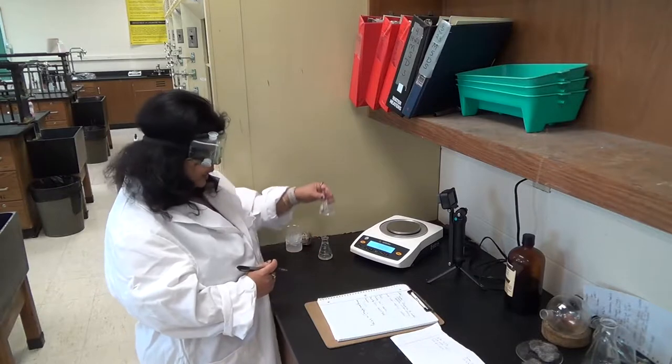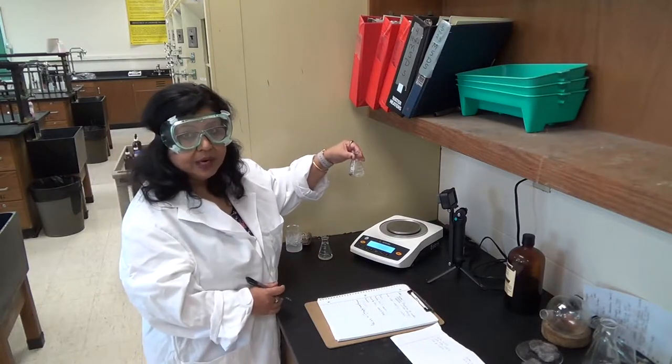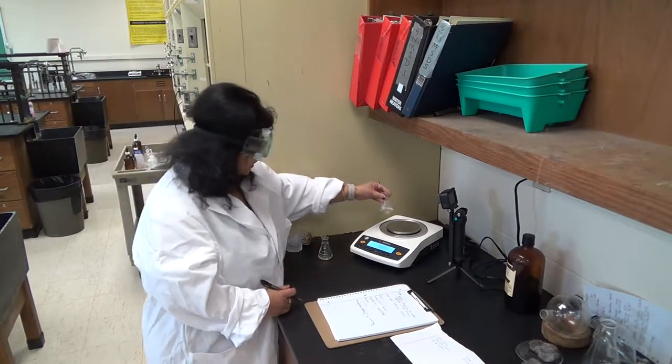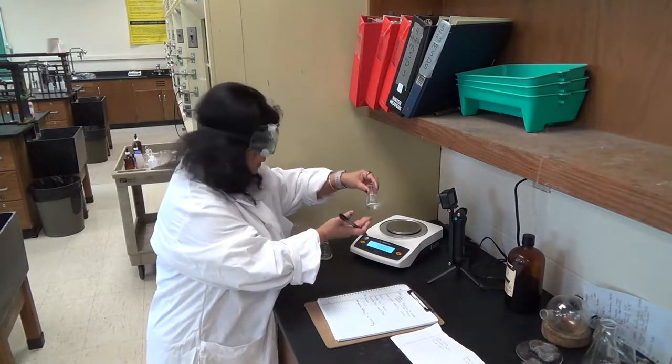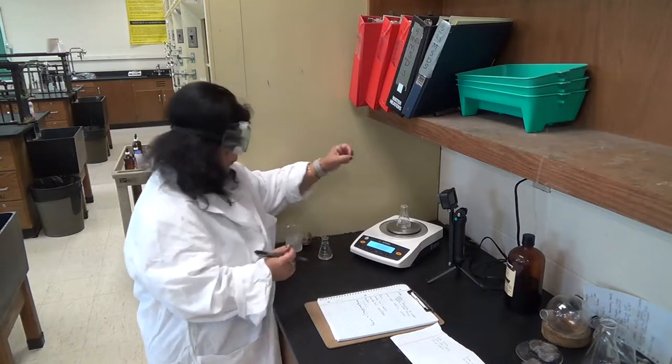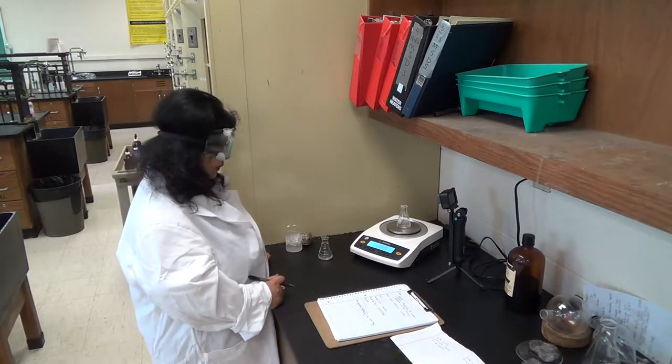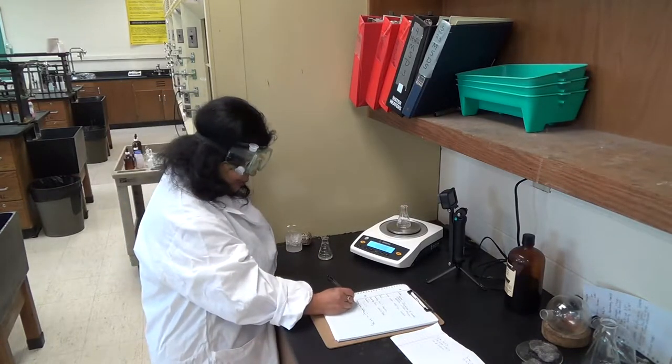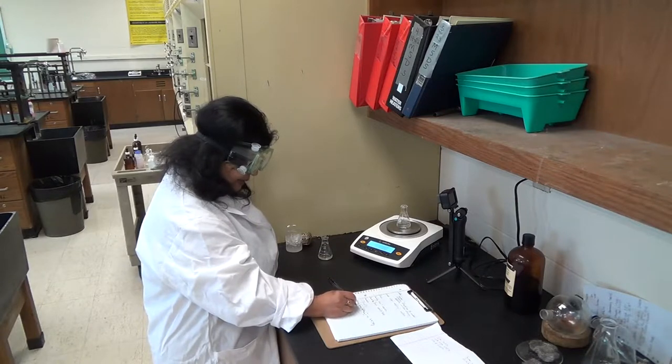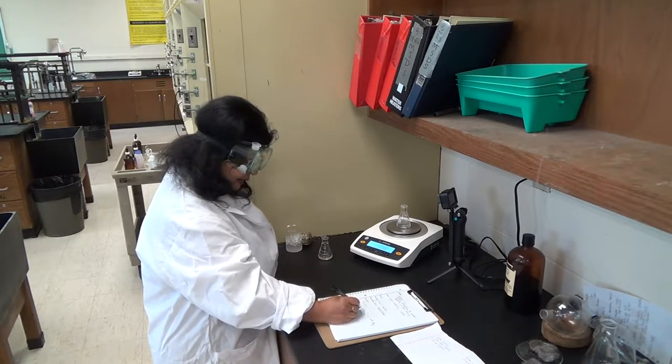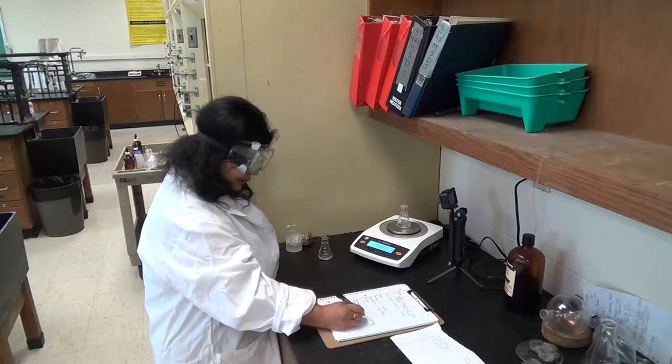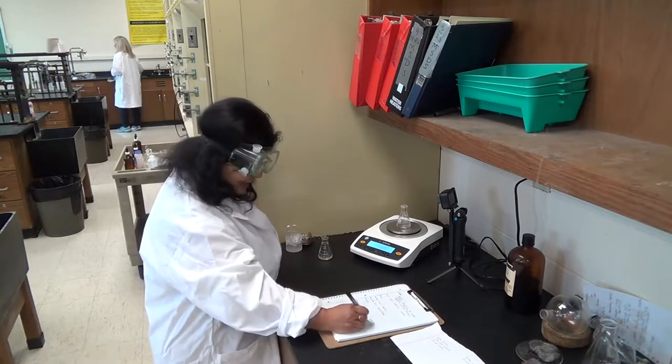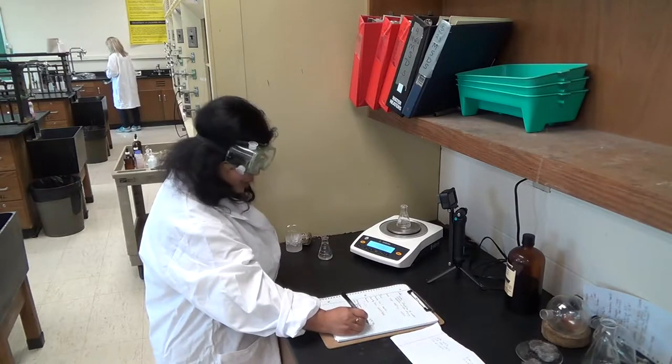So I'm going to weigh the next flask which has sodium carbonate solution. Do the same thing, make sure the bottom is dry. And this weighs, mass of the flask and sodium carbonate, it is 47.28 grams.